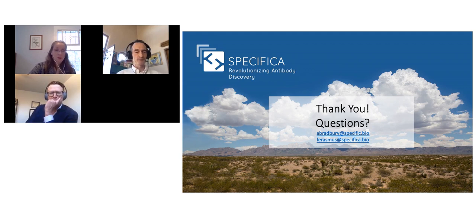So this is someone picking up on the answer you gave about the liabilities. Thank you for your answer about the liabilities. But after the in silico selection of the CDRs without liabilities, how do you make sure they are not in the phage library? Are you synthesizing your full library from that selection? If not, how do you remove the liabilities from the phage library? Sorry, I'm obviously not explaining myself terribly well. So we have a database. Let's think that we're looking at, I don't know, HCDR1, okay? So we have a database of HCDR1 sequences, which is divided into different VH families.